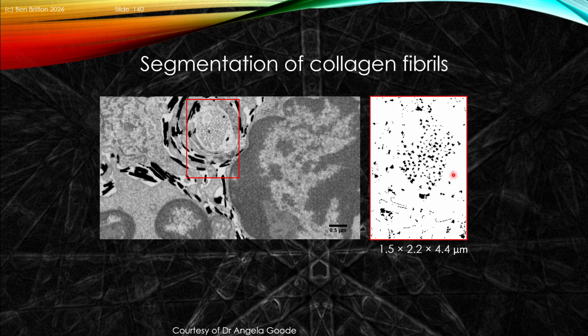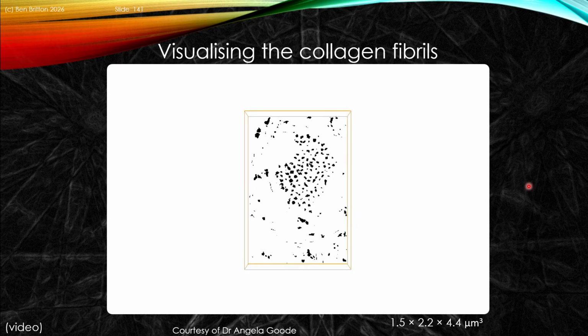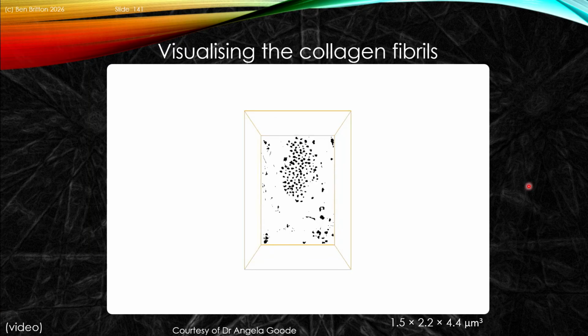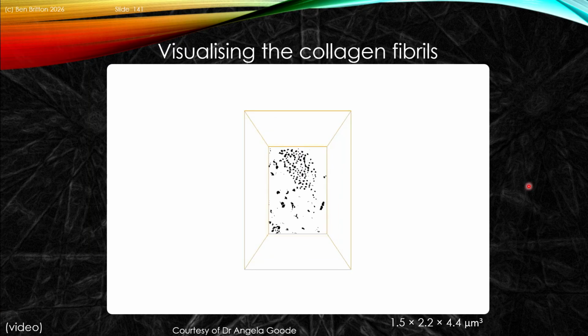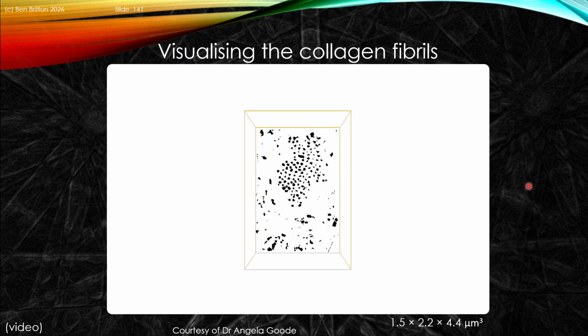Now, what's super nice is that once you've got that data, you can find a common region of interest that contains the collagen fibril cluster, and you can segment using, I think this is done in ImageJ or similar, to effectively identify those features. So you have a small region of interest. But what's really nice is that now you can go through and reconstruct how those fibers are connected slice to slice. So this effectively, again, is that Avizo slicing of the labeled data.